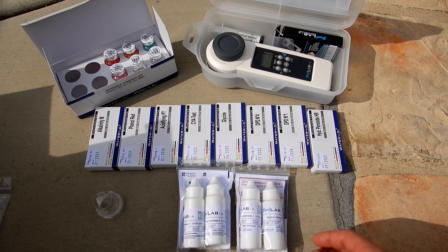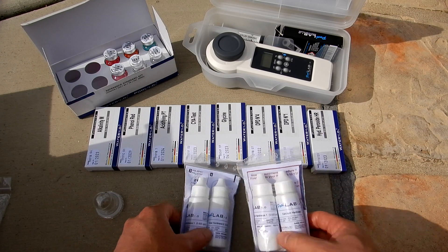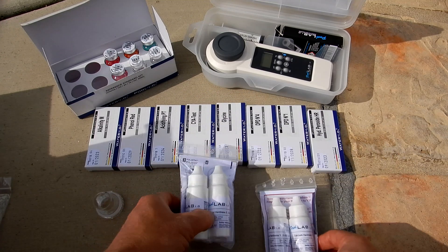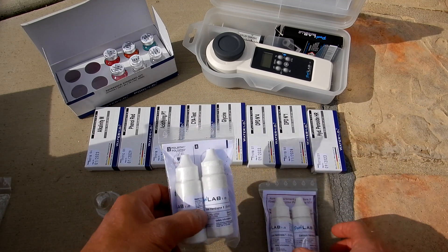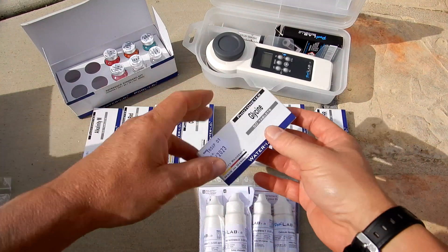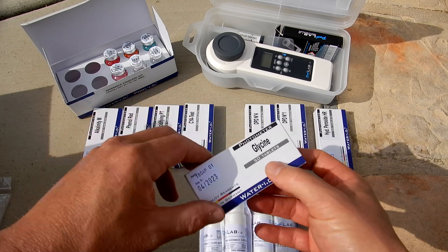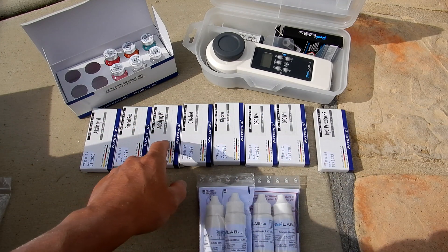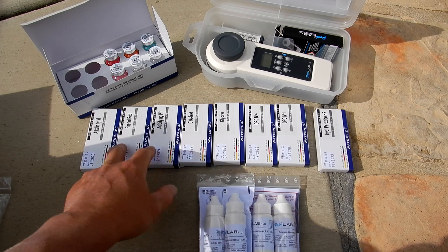Let me go over the reagents and additional tablets you can purchase with the unit. You have calcium hardness and total hardness reagents — these are sold separately. You also have hydrogen peroxide tablets and tablets that test for oxygen. And there are refills for all the DPD, cyanuric acid, pH, and alkalinity tablets.